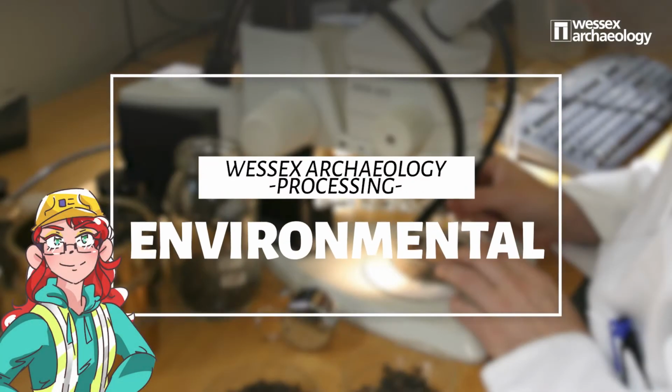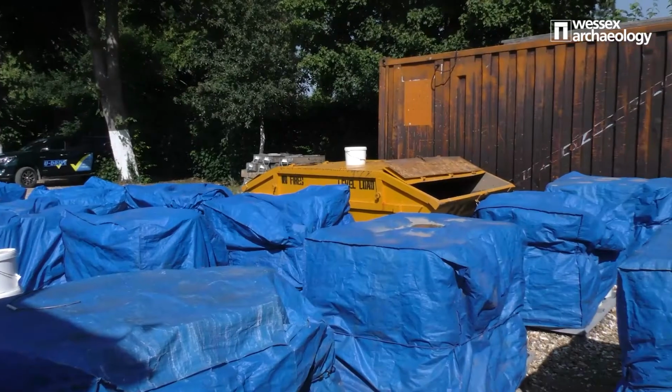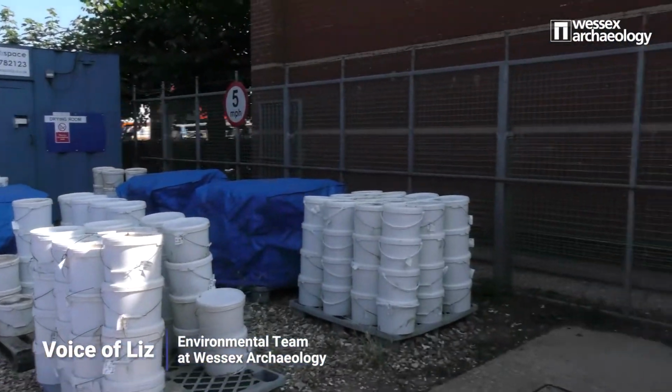Just as finds can help solve pieces of the archaeological puzzle, so too can environmental remains. Here we can discover what plants were growing in the Stone Age, or even how much charcoal they were using in their cooking. Environmental archaeology helps us interpret the landscape of the past and how people interacted with it.